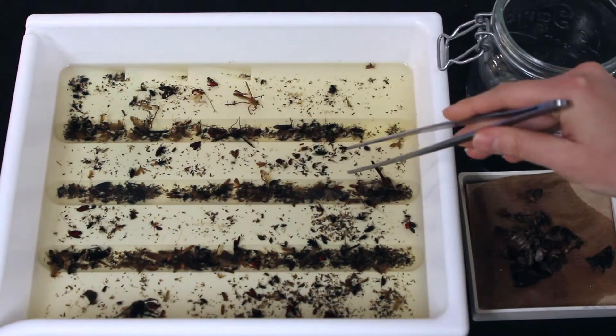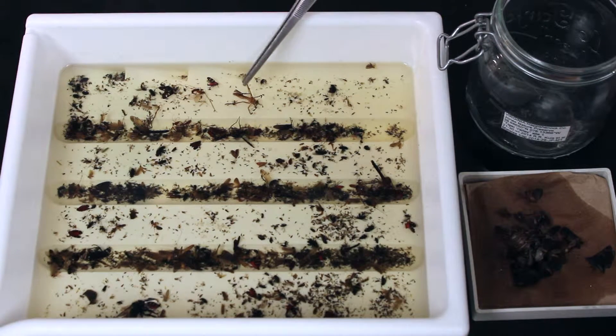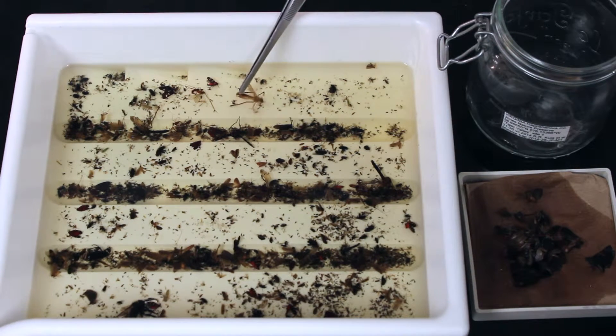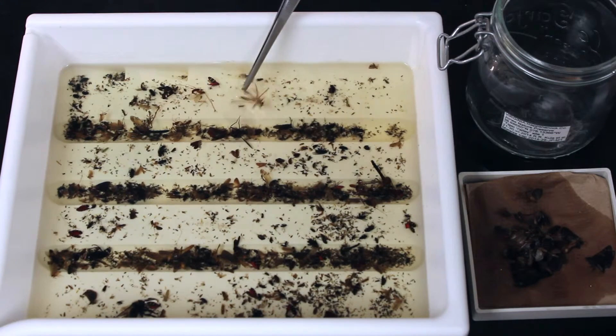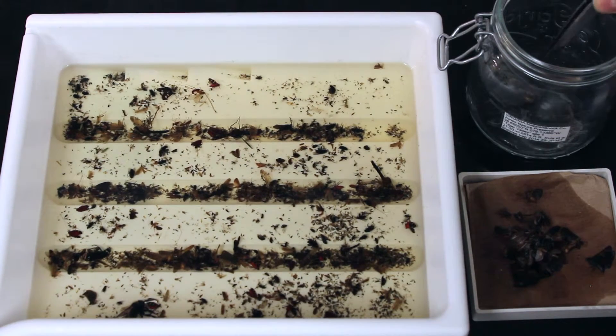We're looking for easily identifiable non-target taxa. For example, this dipteran is very easy to pick out. So we give them a shake, make sure nothing's attached to them, and place them in our bale top jar.